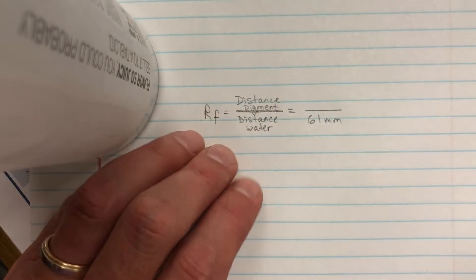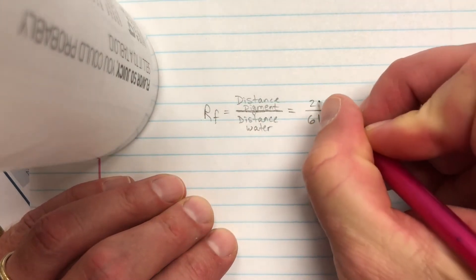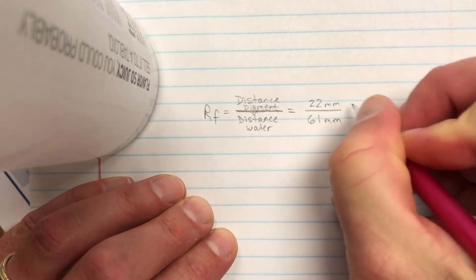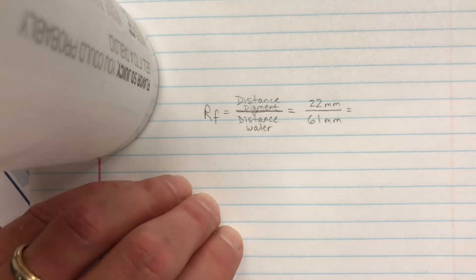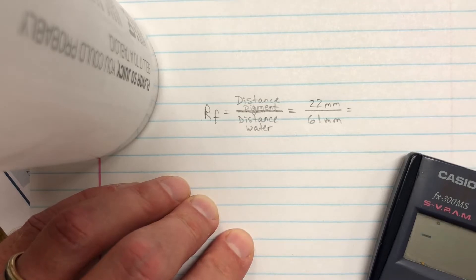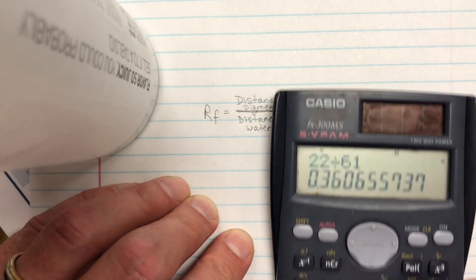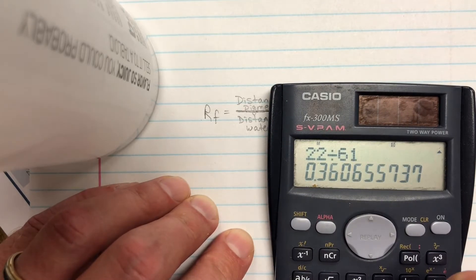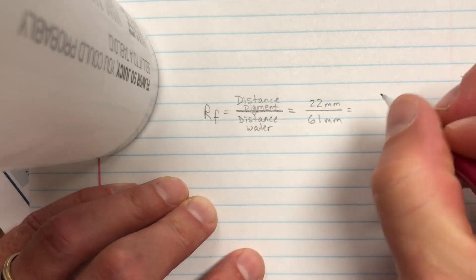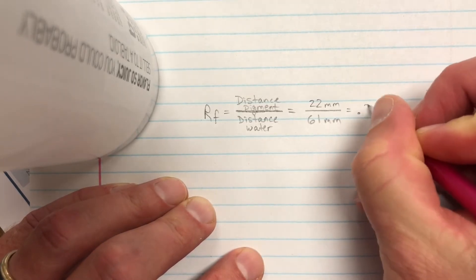So 22 millimeters, that's going to give me 22 divided by 61. It's going to give me a ratio, and I'm going to use two sig figs here. It's going to give me 0.36, so 0.36 is going to be the RF value for my yellow pigment.